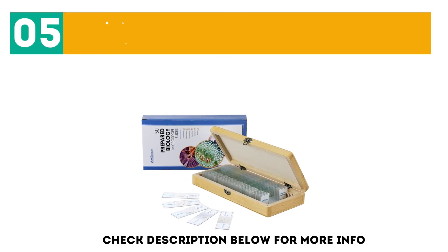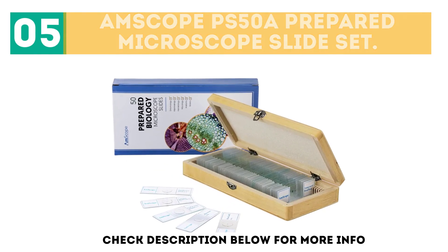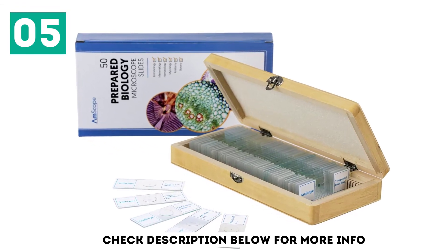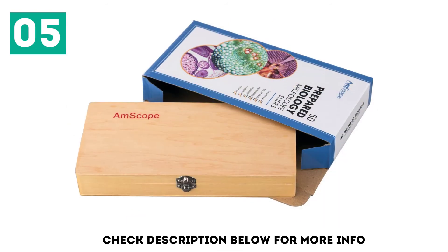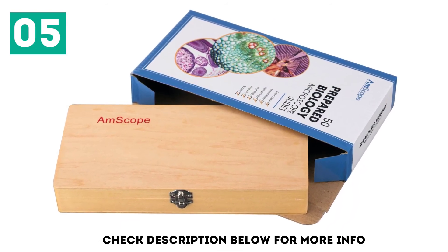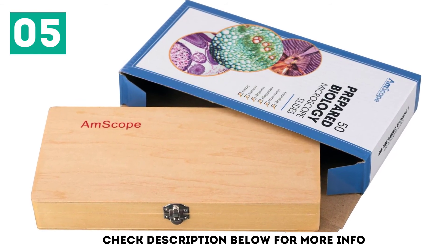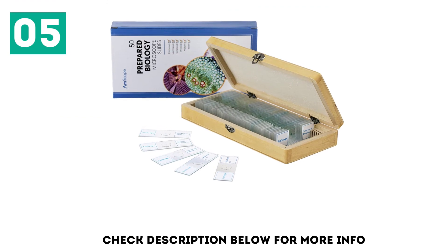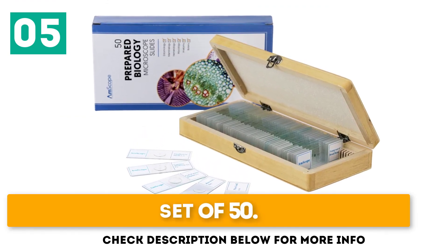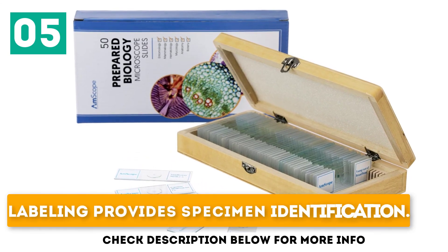At number 5: M-Scope PS50A Prepared Microscope Slide Set, including plants, insects, and animal tissues, for use in biological education. It is an all-in-one set with a protective wooden box to prevent breakage and ease handling. Suitable for basic biological science education and also a precious gift for those who love biological science. Key features: set of 50 slides, protective wooden box, and labeling that provides specimen identification.